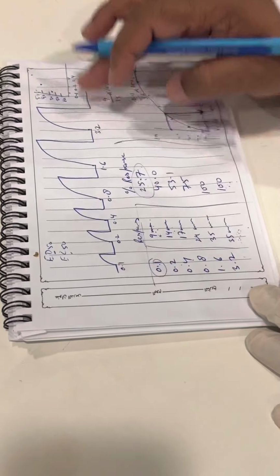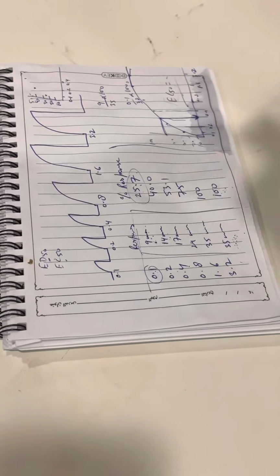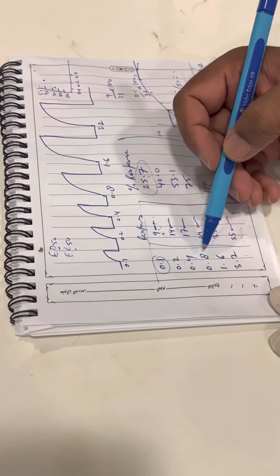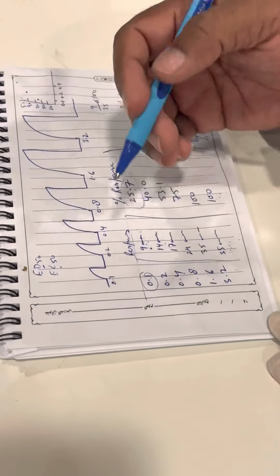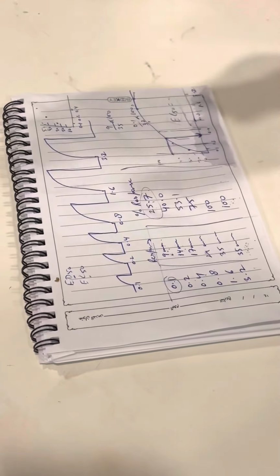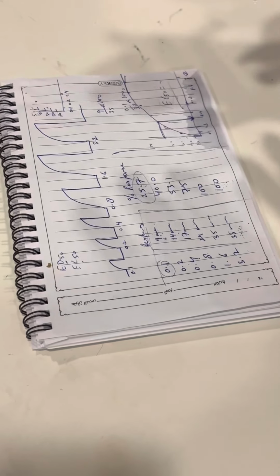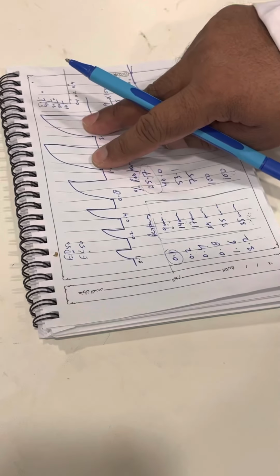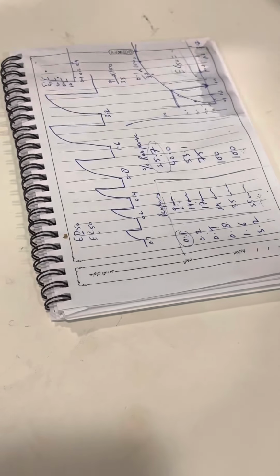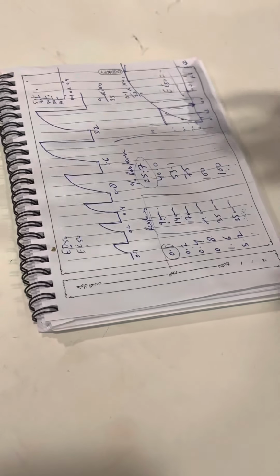Same graph you will get in the system, but every time you have to double the dose: 0.1, then 0.2, 0.4, 0.8, every time double the dose. And your response will also increase every time. But at the end, when all these receptors are saturated, you will get the same response in the last two doses. You will not increase the response. So when you get the same last two responses, stop the experiment.